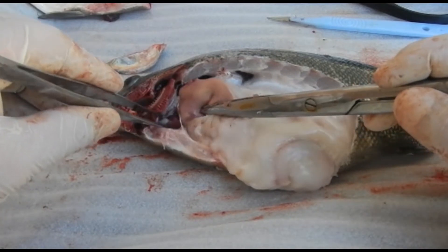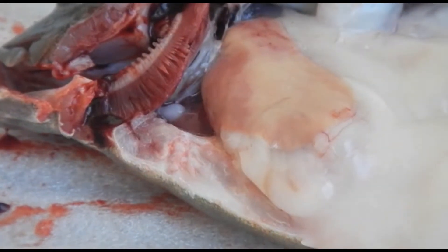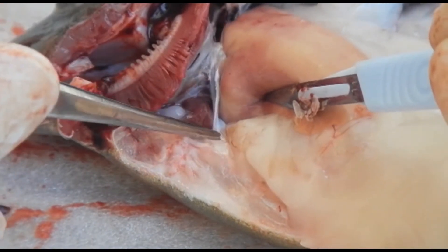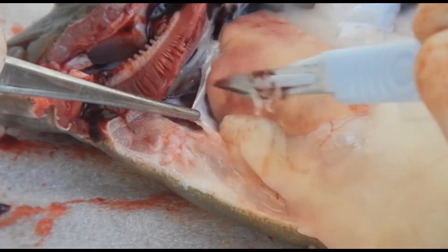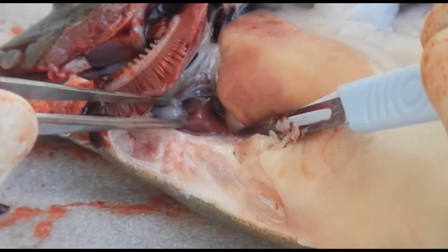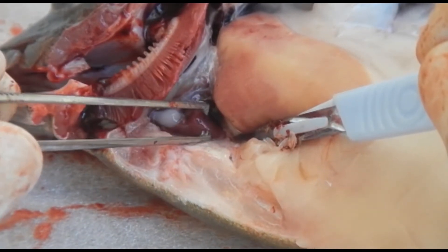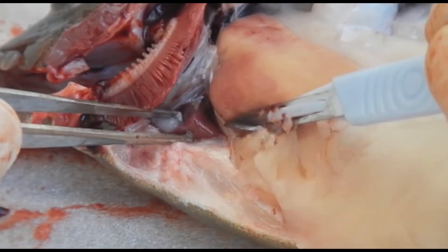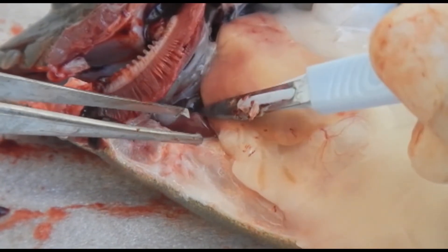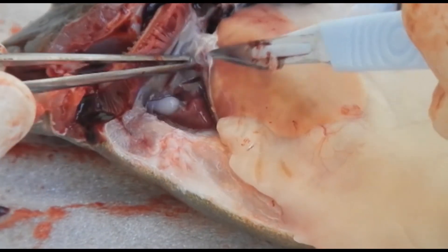Now we'll have a close-up look at the heart, which is very close to the gills. It's still beating, which is very normal in freshly dead fish. There's a little membrane called the pericardial membrane that separates the rest of the coelomic cavity from the heart. What I'm holding with the forceps is the bulbus arteriosus. Then this one here is the ventricle — just a bit of a pyramid shape. Above that is the atrium, and before that is the sinus venosus, which is quite difficult to see here.